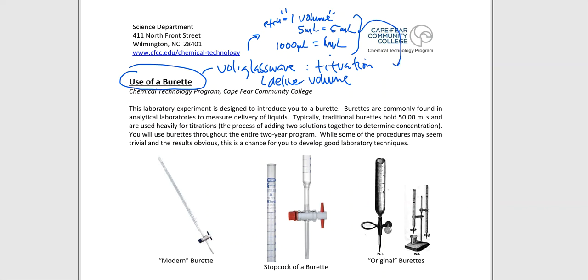Okay, now you're talking like graduated. Well, there's graduated volumetric pipettes. Yeah, there's graduated pieces. They're not the best. All the time we want to go to that one volume stamp whenever possible, because the graduated volumetric pipettes are going to have a little bit less accuracy and a little bit less precision than the normal standard run-of-the-mill volumetrics do, but they still do an excellent job.